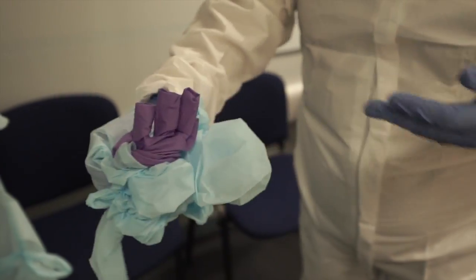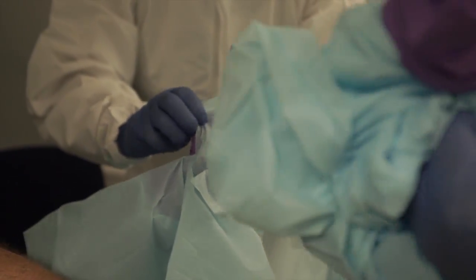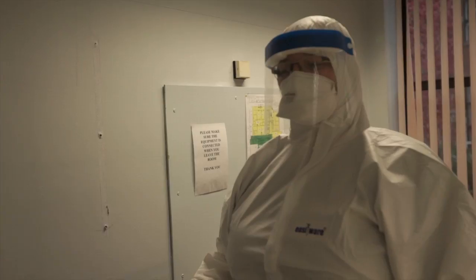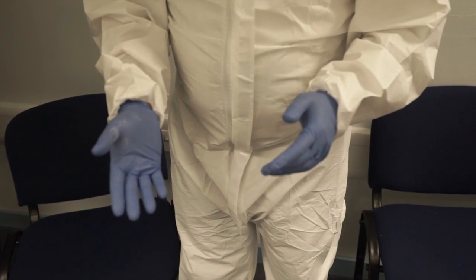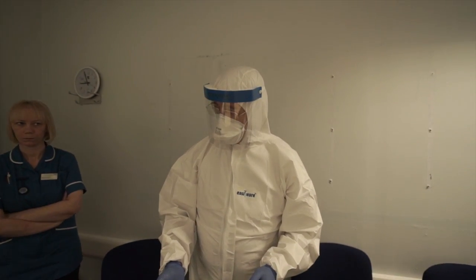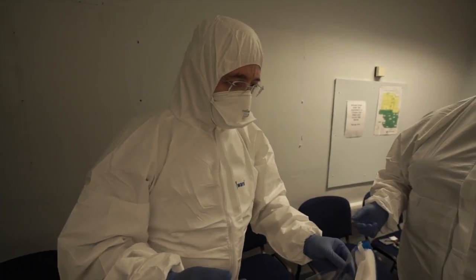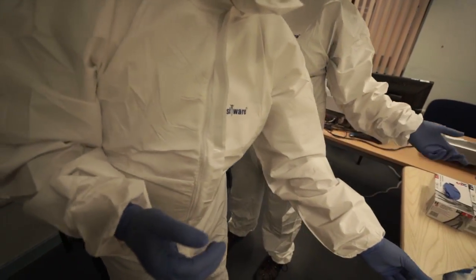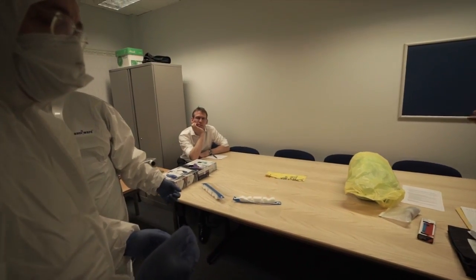Then take your gloves off and wrap it in, and then it goes in the clinical waste. I want the gloves to come off at the same time, and then you roll it all up as small as possible. By not touching the outside — you've still got the inside. Everything is clinical waste, single use only.